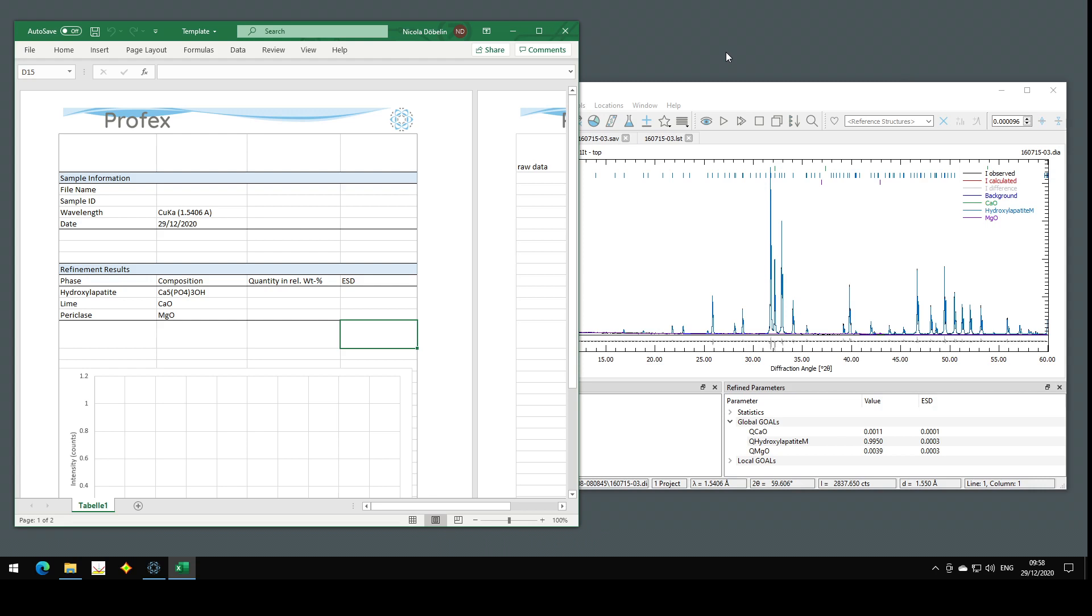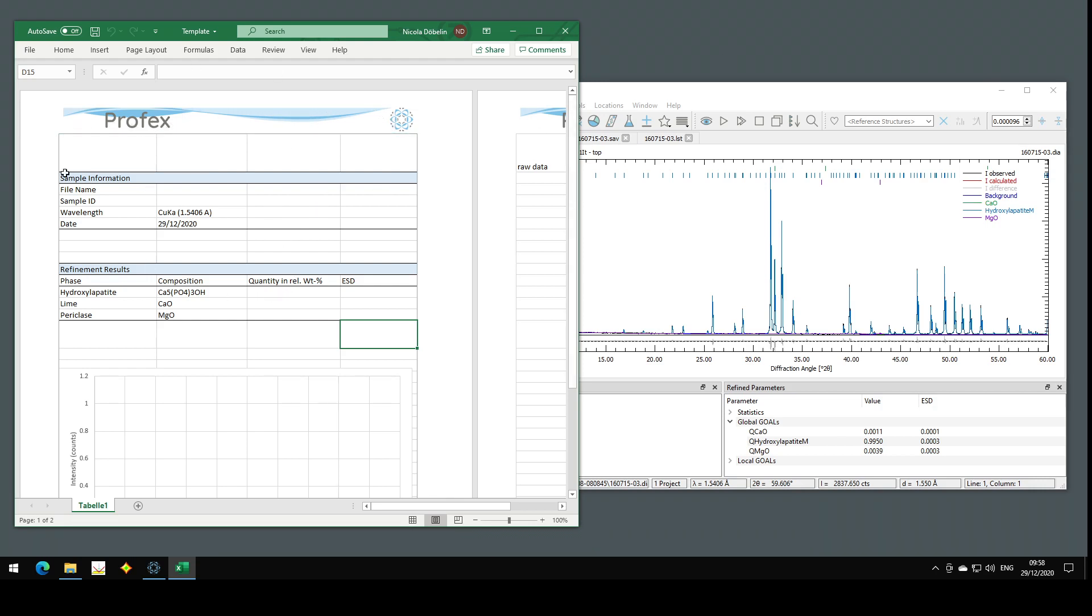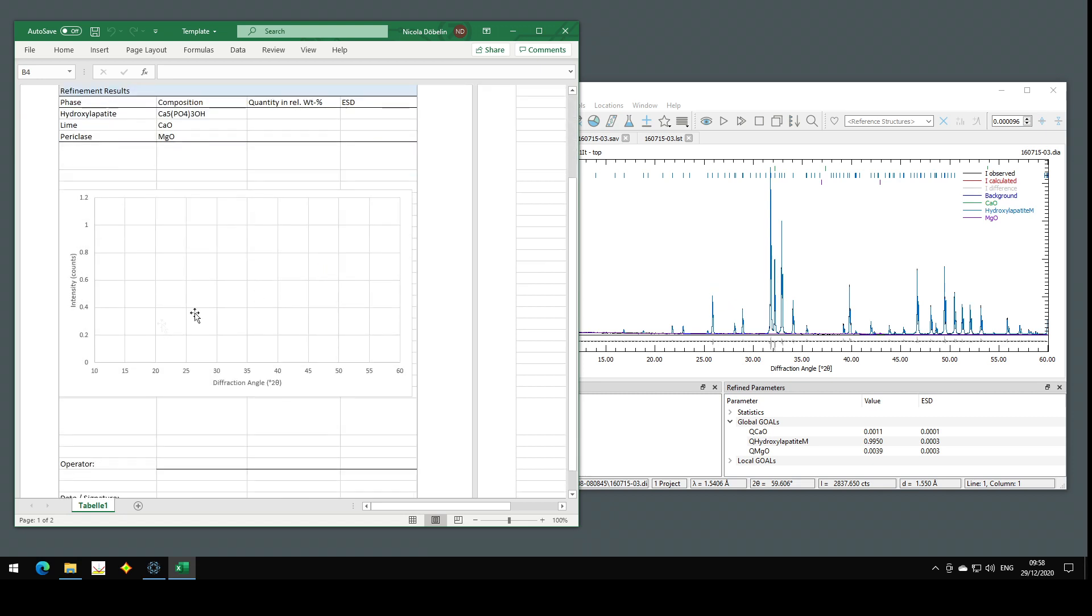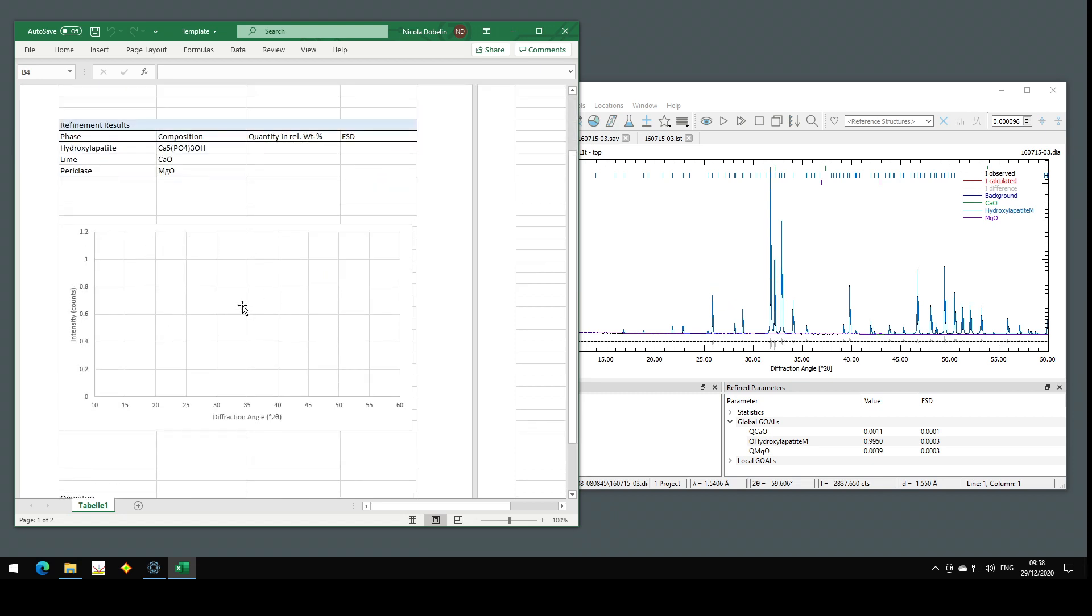At the beginning of the video, I showed a much nicer template with some header logo and some more formatting, but it basically works the same. It writes the file name to this cell, the sample ID here and the refinement results here. And I also have the empty graph here.